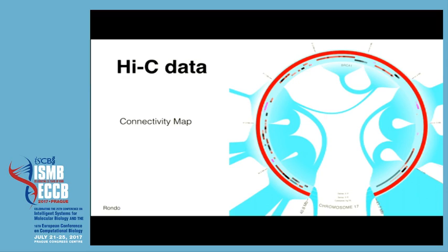What we do is have the sequence wrapped around a circle, like a circos plot, and we cluster the data, here at 0.1 megabase resolution, and we have edges that are bundled together. The thickness is proportional to the strength of the connection. And then, as you can see over here, you can add metadata about cytobands, genes, and tags, without crowding the visualization itself.